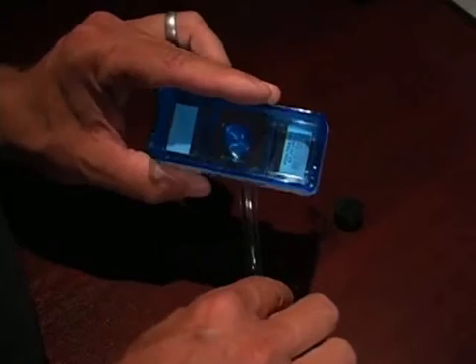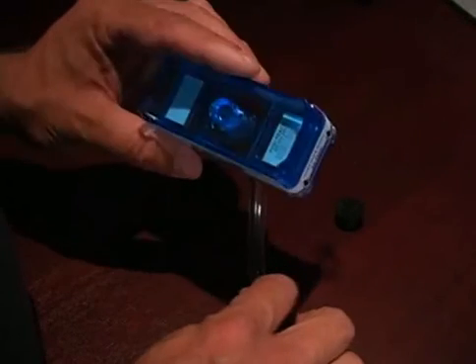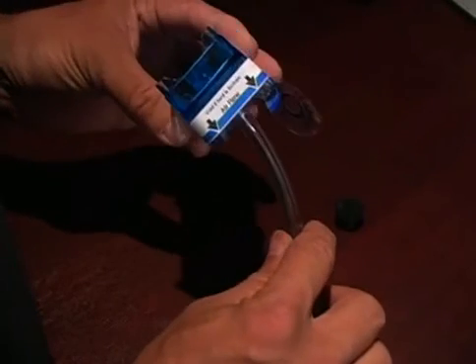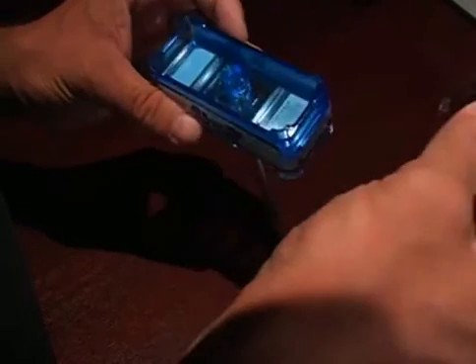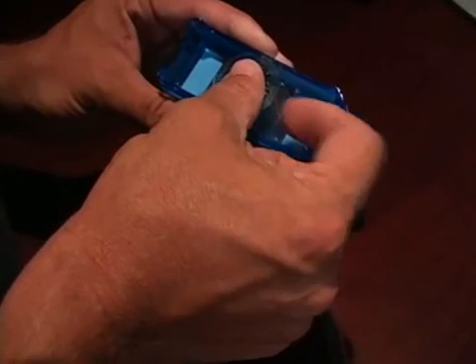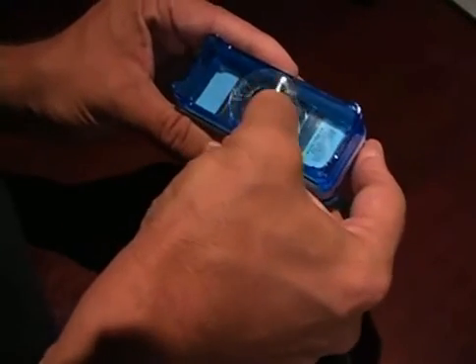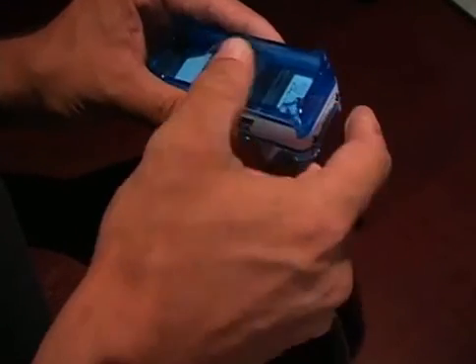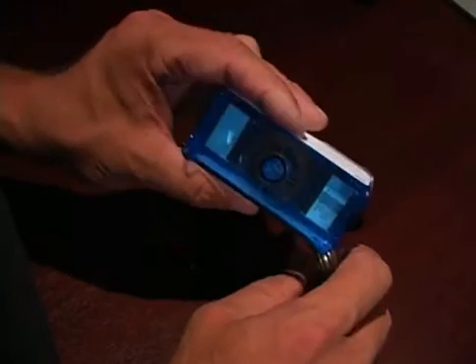Turn the pump on, 5 minutes, let's say, and then when sampling is complete, turn the pump off, record your notes, replace the cap. Actually, I like to replace the cap and then make my recording on my work log and chain of custody. Get a nice good seal. Then make your field notes in the areas of your work log and chain of custody.